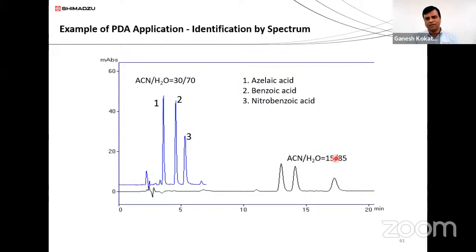Now I'm expecting the first peak to be azelaic acid, the second benzoic acid, and the third nitrobenzoic acid, as compared to this.